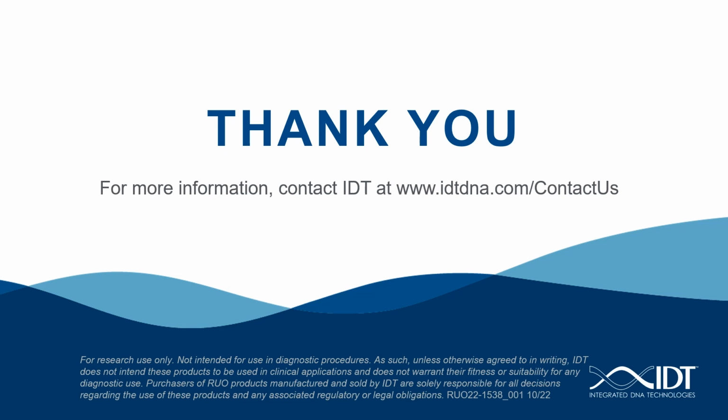Okay, the second question is, is the master mix compatible with different real-time PCR instruments? Yes, the data shown today were generated using the QuantStudio 7 Flex, and the master mix has also been successfully used on the Bio-Rad CFX384, the Roche LightCycler 480, and the QuantStudio DX in the RUO mode.